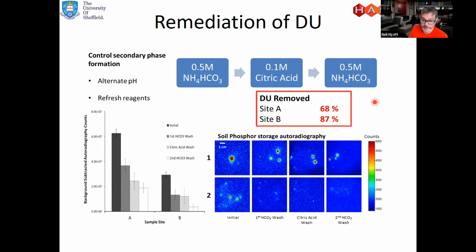We also used autoradiography to track the dissolution of individual particles of uranium, and we see clear evidence of particles being attacked through the leaching process. To conclude this short second part of the talk, we've used multimodal microfocus X-ray techniques to provide critical insight for the design and improvement of DU remediation technology by probing the extraction mechanisms through characterization of the residual materials.